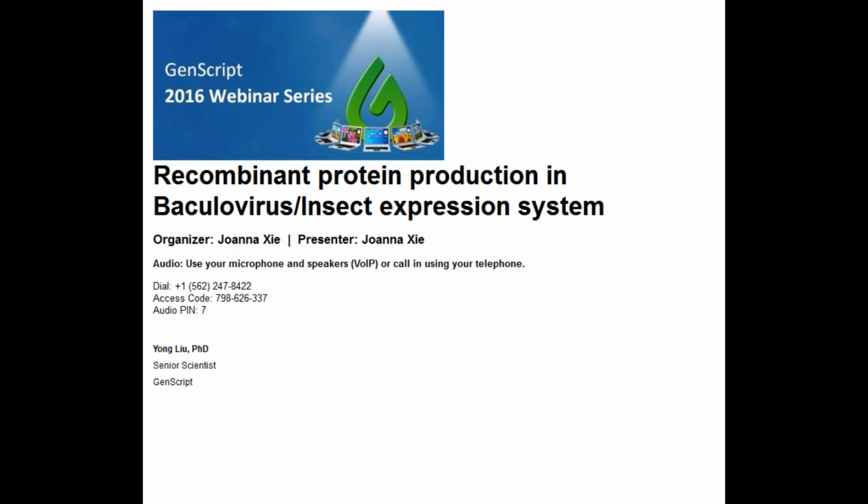So finally, when you have enough baculovirus, you can infect the insect cells with it for protein expression, and small volume culture can be produced in different sizes of flasks. Typically we can do anywhere between 40 ml and 10 liters in flask. And for large volumes, we can conduct recombinant expression using wave bags, anywhere between 10 to 100 liters. After about 2 to 4 days of culture, cell pellet and supernatant are collected for protein purification.